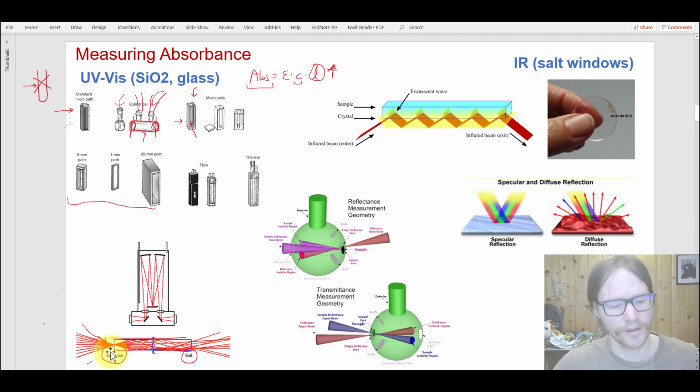This stuff enters at different angles, and we can control that angle, and what it does is it bounces off inside of the cell and maybe even back and forth, and oftentimes you can get maybe 100 or even 1,000 passes inside the cell from a single photon before it finds the exit slit over here, which means maybe this whole thing is a few centimeters long, but the path length of the photon then artificially gets increased to several meters or hundreds of meters, in which case you are cranking up your absorbance sort of artificially.